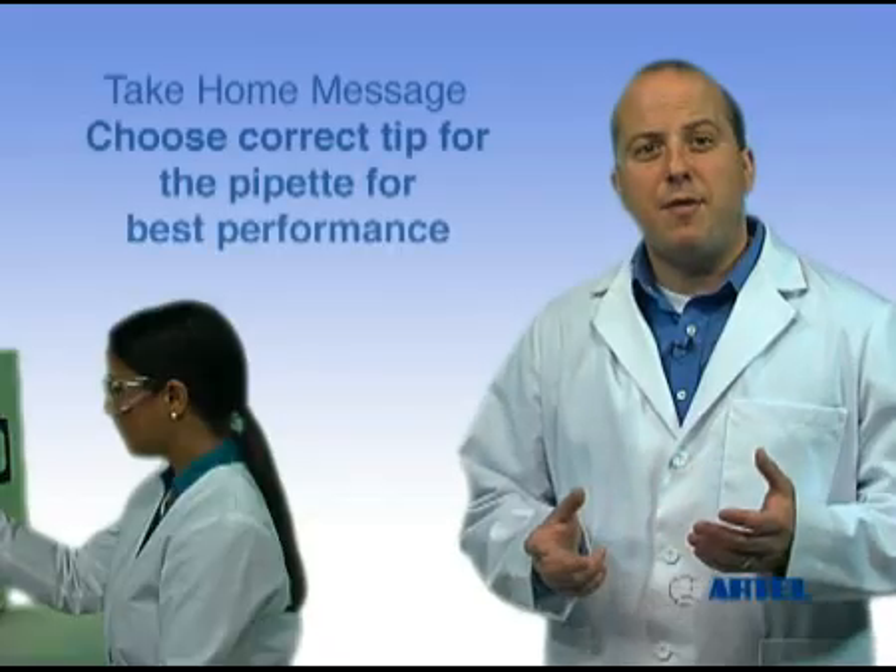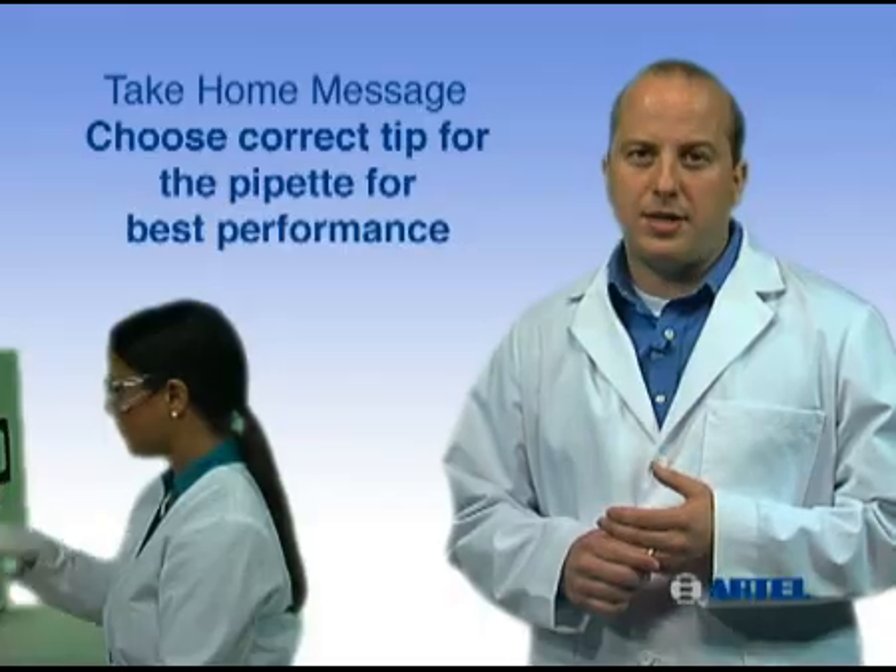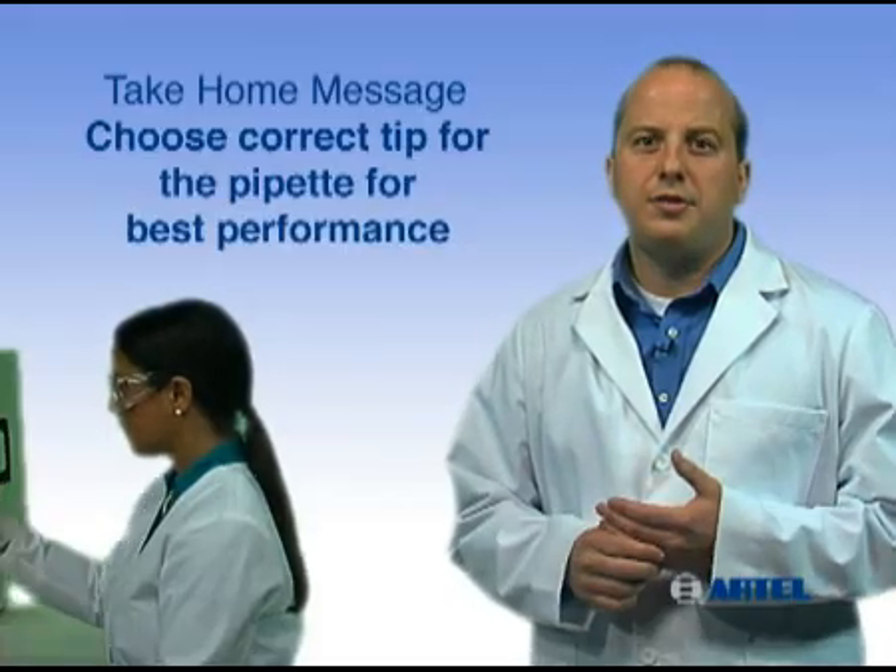The take-home message is: proper tip fit is important to ensure a tight seal between the pipet and the tip, and sample loss due to leakage will be minimized.